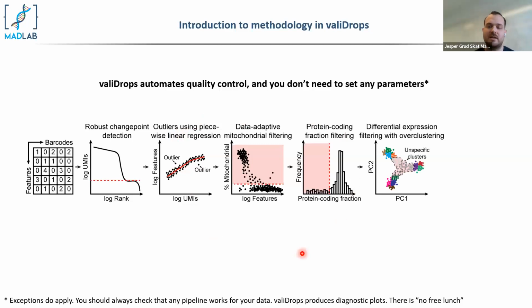And we do this in a sort of peculiar way. We cluster the cells or barcodes that pass all of these filterings, and we do that at 2 different resolutions. We do it at a very fine-grained resolution, which is the one that's depicted here, where we get a brown, green, blue, orange, and a light gray cluster, and all of the other ones as well. And then we also do it at a much lower resolution, where, for example, we would find only one cluster containing all of these 5 clusters up here.